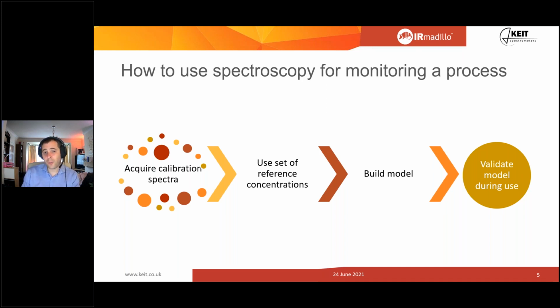Sometimes you take a sample offline and there are chemicals that exist there that go off: intermediates, transition states, chemicals that do not last very long once you take them out of the process. But you see those online. So I personally think it's really important to do both.